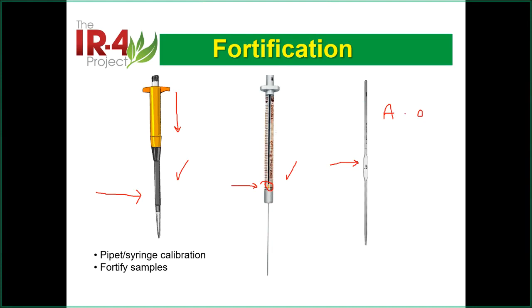The error is typically very small. I think this one is 0.01%. It depends. If you have 10 ml, this is probably 0.01%. It depends on the volume.